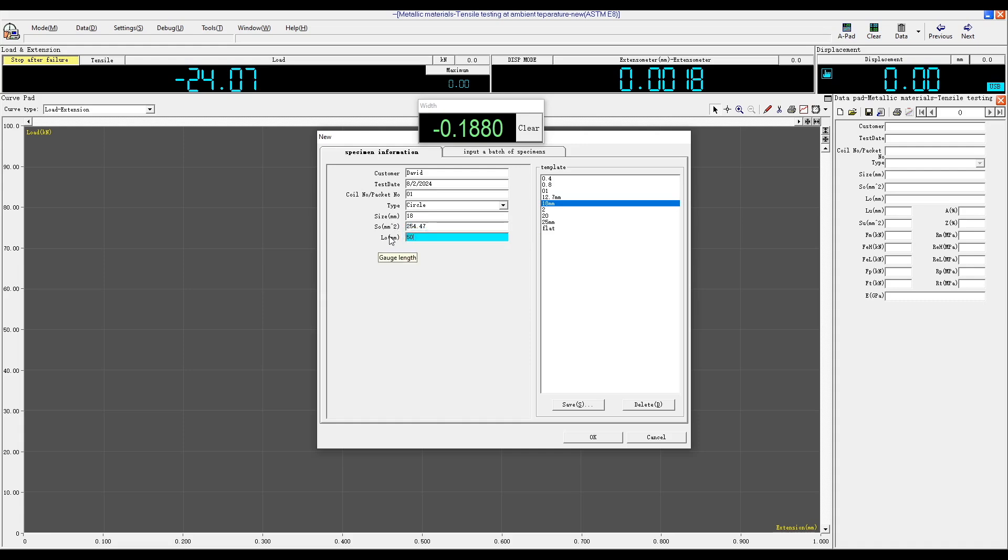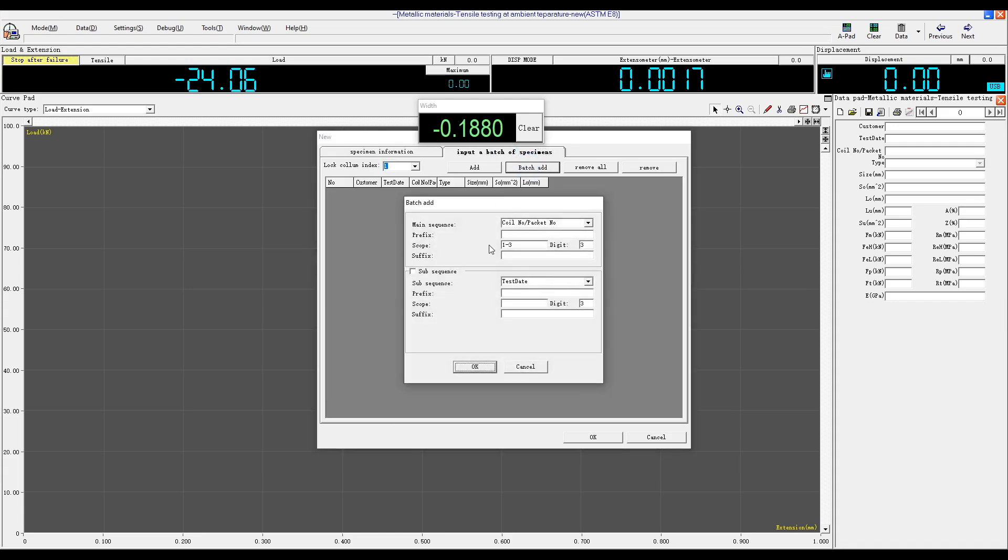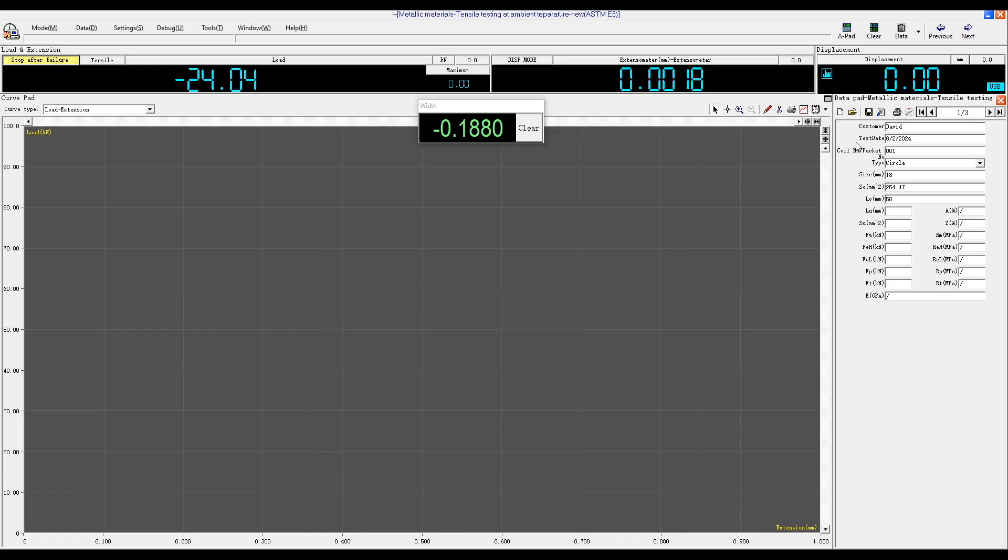Click on the input a batch of specimens tab to open the batch add window. For example, we can choose to test three samples. Click OK. We will test one by one. Close the data pad.